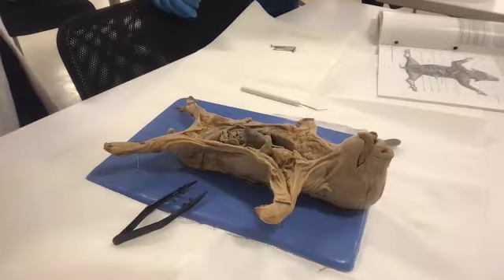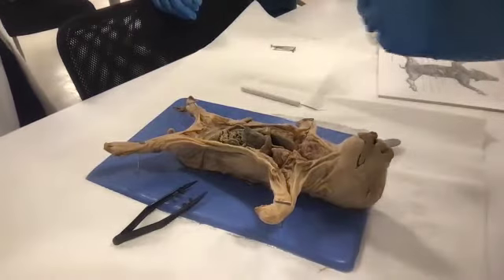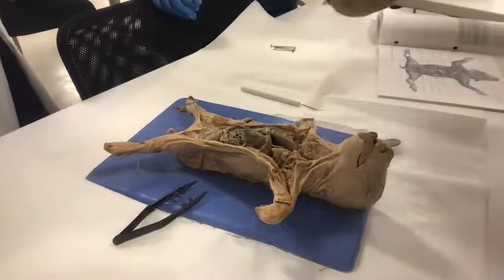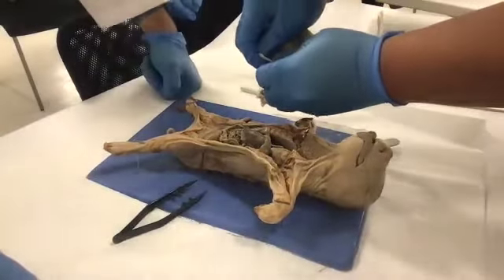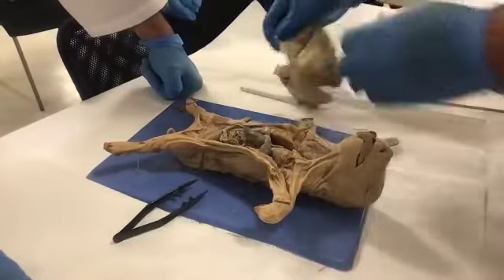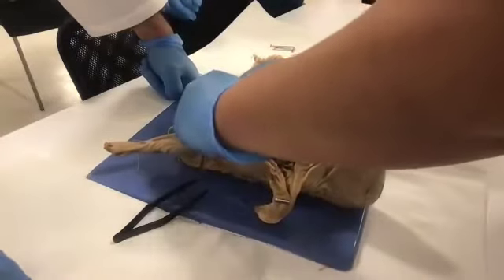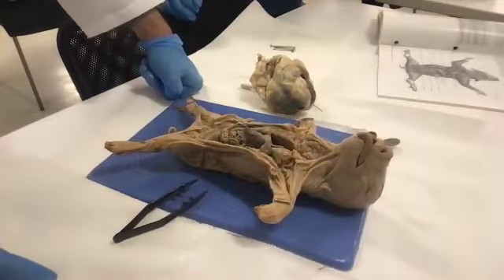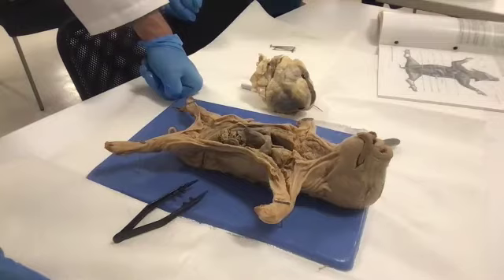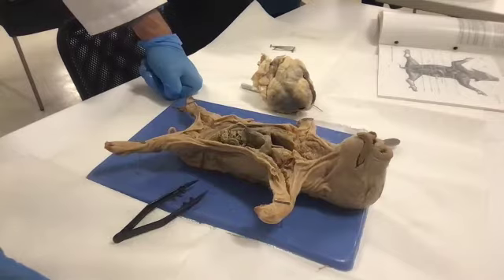Yeah. And here with the heart, this one had the pericardium attached to it. See this? Here, and remember the last time we had the dissection? Look, I'm really trying. I can't rip it. Same thing with the outer skin. It's really hard to rip the outer layers. So we already now know that things that are tougher in the human body and in anatomy are on the outside. And it makes sense because the outside world is a harsh place.